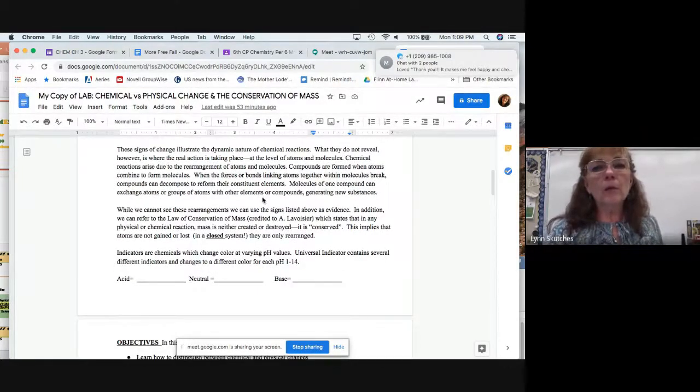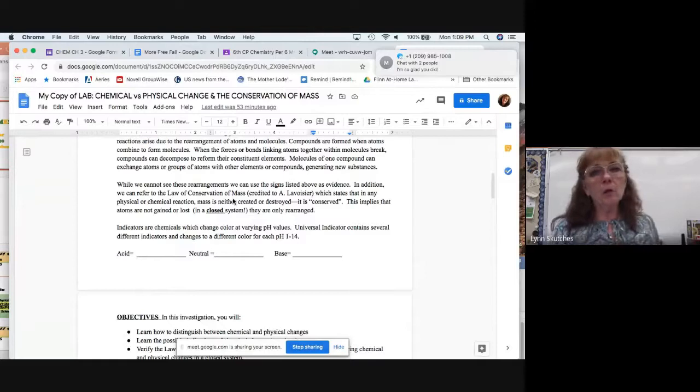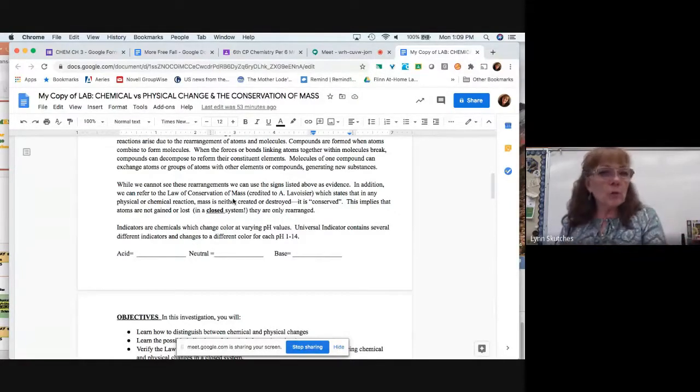The changes that we're going to be looking at, it's really important to keep in mind that matter can't be destroyed or created by a chemical reaction. Whatever you end with, you had to start with, whether you realize it or not. The air in the room has oxygen and nitrogen in it, and they can become part of the stuff that you're forming. And that happens a lot. So it took a while for people to really get on board with this law. The other thing is, as you'll see today, when you make a gas, it's really hard to keep it in a container. So the baggies that I used earlier today were really good and stayed sealed. The ones that I used fifth period, not so good. It leaked a lot. So anyway, that's a problem.